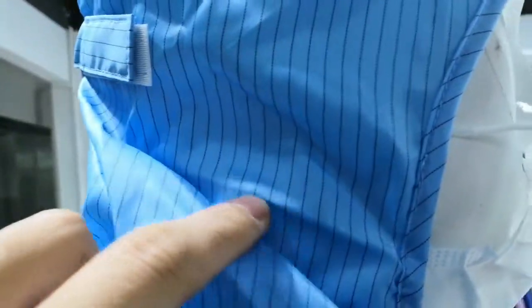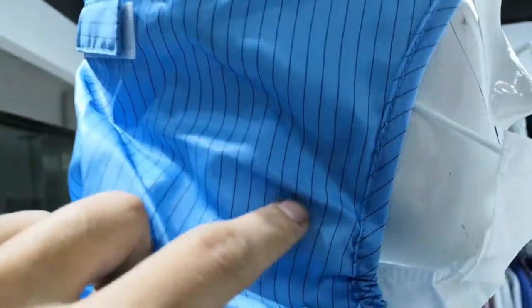This part can be on the left. The fabric we used is a high-quality anti-static fabric. Those are carbon fiber.